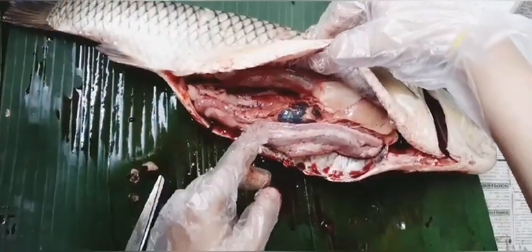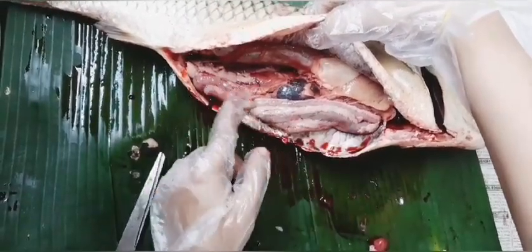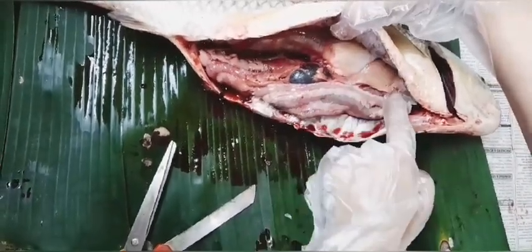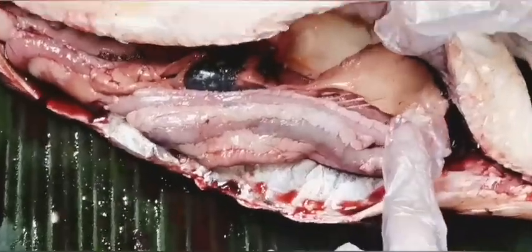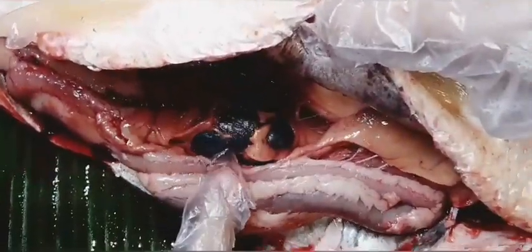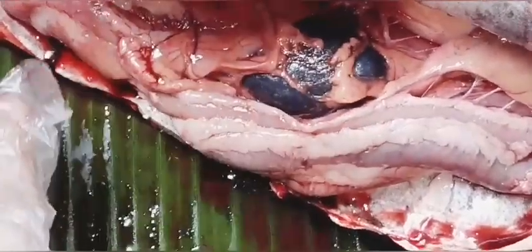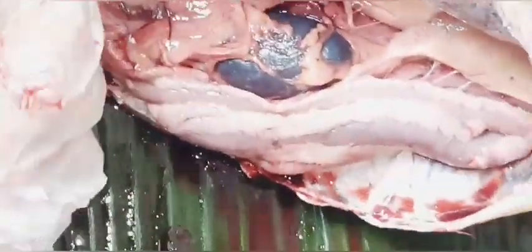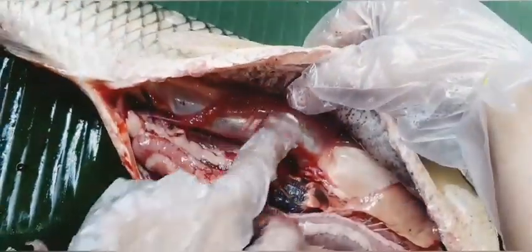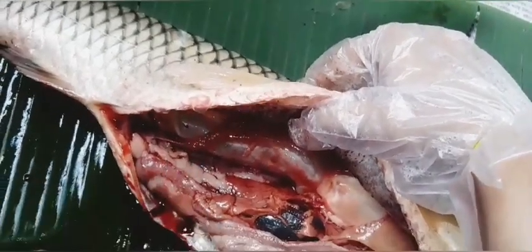So now let us talk about the other parts of the fish. So it is probably the intestine. This is probably the intestine, and this, which maybe you can see, this skin type color, is the liver, and that green color, it is appearing green, is the gallbladder of the fish. It is similar to that of us, the humans. And if we look deep inside it, then we can see some bag-like structure.